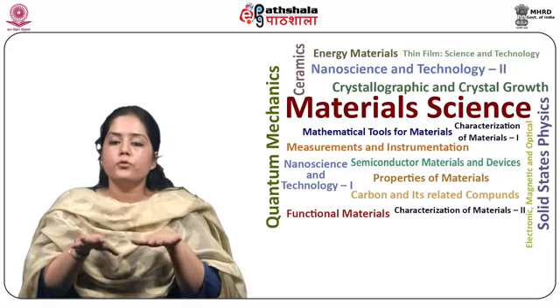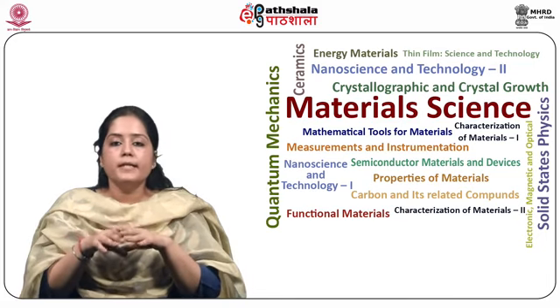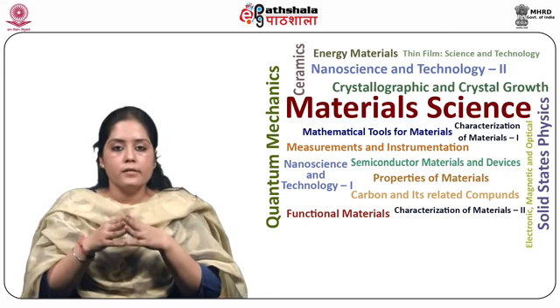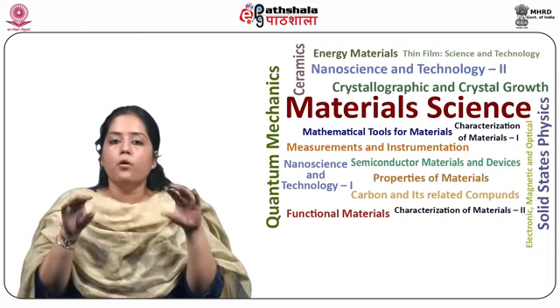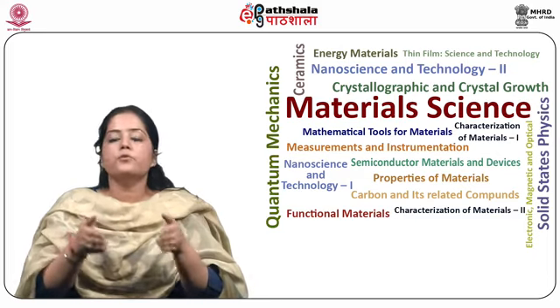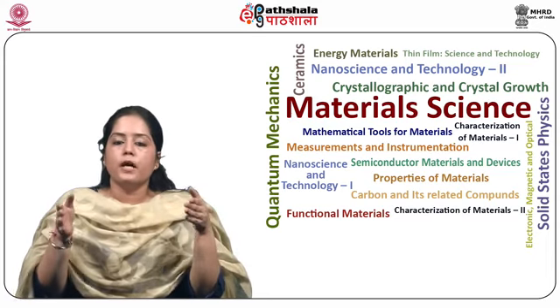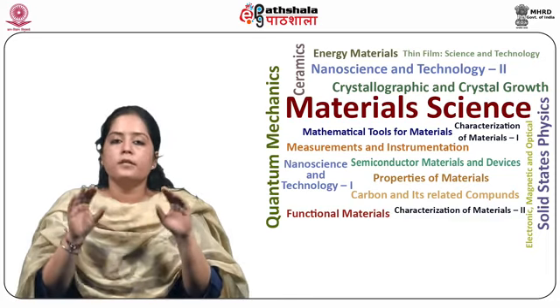The linear photodiode array is an example of a multi-channel photon detector. These detectors can simultaneously measure all the elements of a beam of dispersed radiation. A linear photodiode array consists of several small silicon photodiodes created on a single silicon chip.